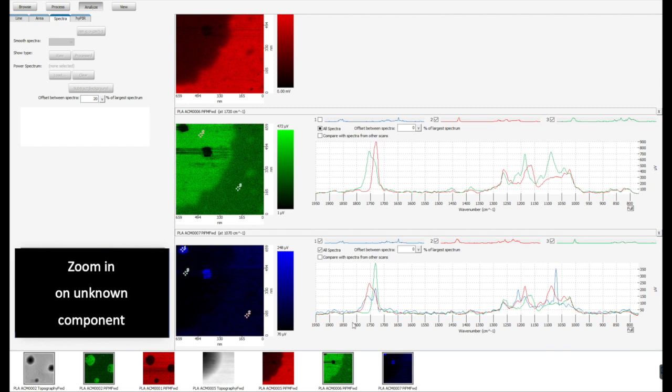So then what we decided to do is go and take a point spectra on one of the little black dots. And so that's what you're seeing here at point number 1. Here you see that it's almost like a distributed or splitting between the 2 peaks that we saw for the ACM and the PLA. But what we do notice now when you go into that 1300 to 1100 region, two definitively new peaks associated with that particular material. So is it an unknown?